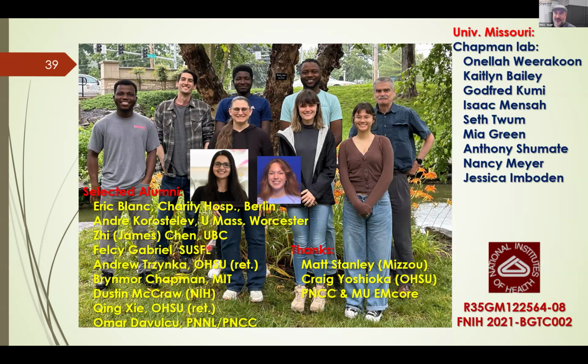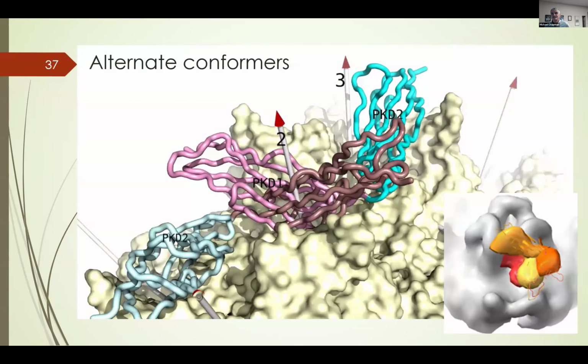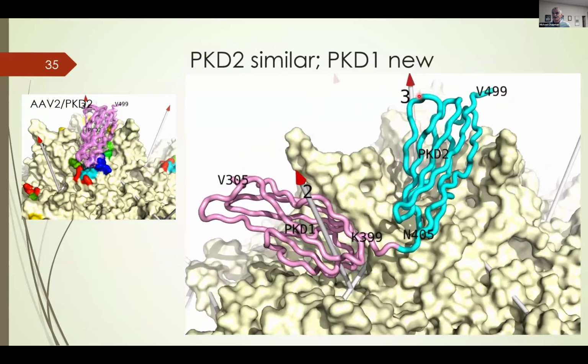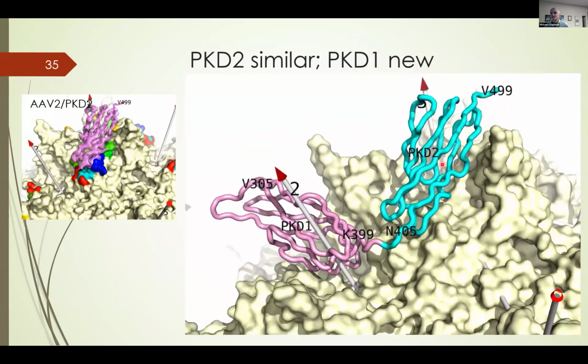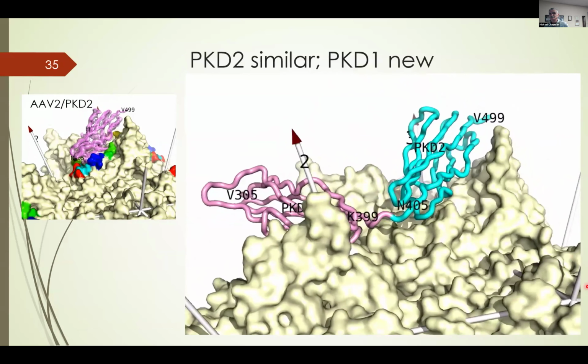And what software are you using to make your illustrations? And can you tell us what the different axes represent? Oh, I'm using PyMol, and the axes that I was showing, I could maybe go back to one or two of them. Let's find one that's clear. The axes, this is a threefold axis of symmetry, icosahedral axis. This is a twofold, and this is a fivefold over here.